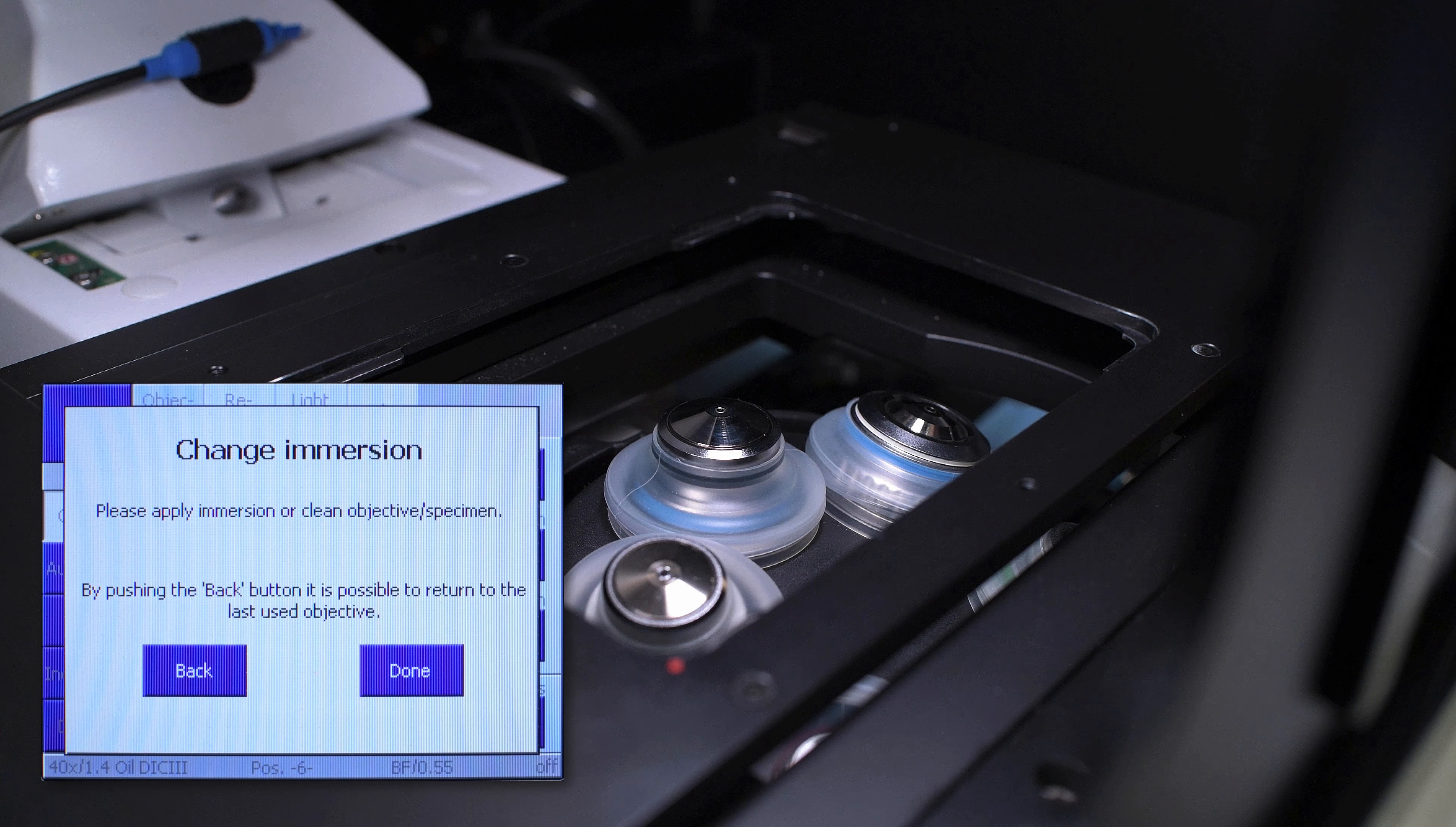If a dry objective was in place, the TFT will display a notification warning you that you are about to move from a dry lens to an immersion lens. This mechanism protects the objectives from coming into contact with immersion fluid if they are not designed for it. It is very important that you take great care to keep dry lenses dry.